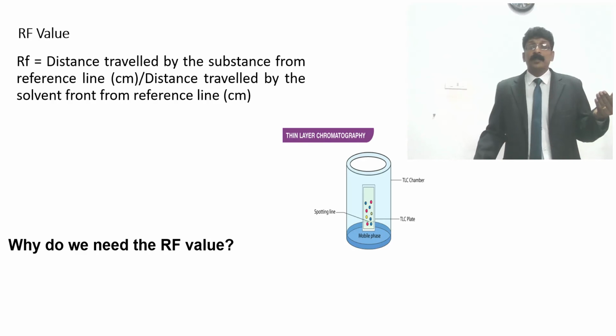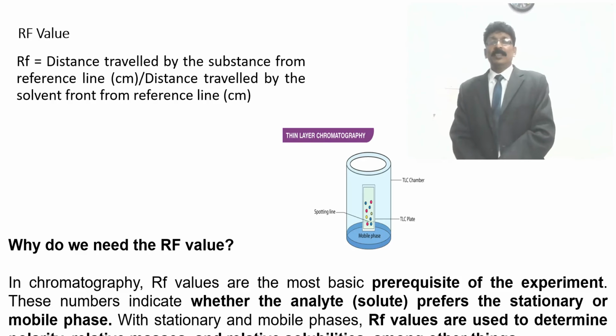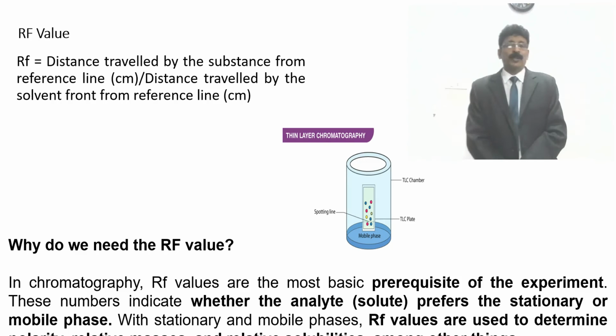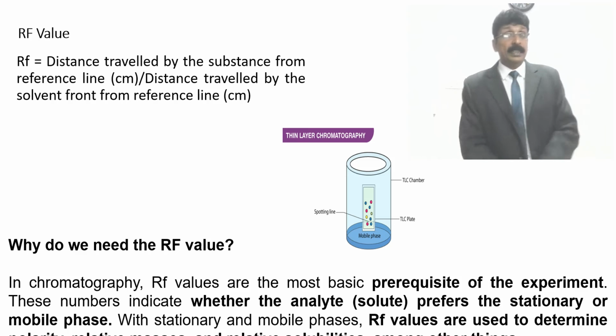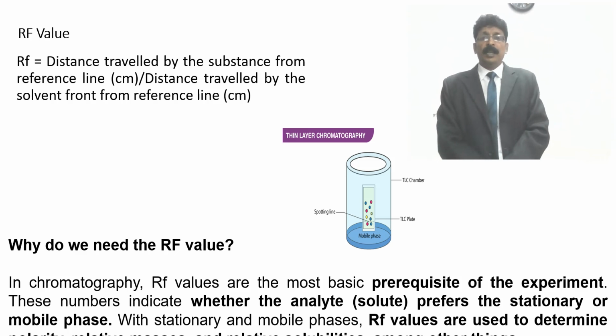So this is a picture which I have taken from Biojuicer. It is the same thing. They have used a beaker actually, but the chamber for the TLC plate is a rectangular tank. It's a big TLC plate. You can see it in your laboratory.